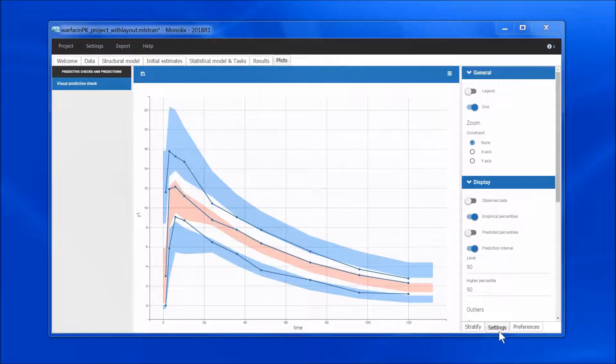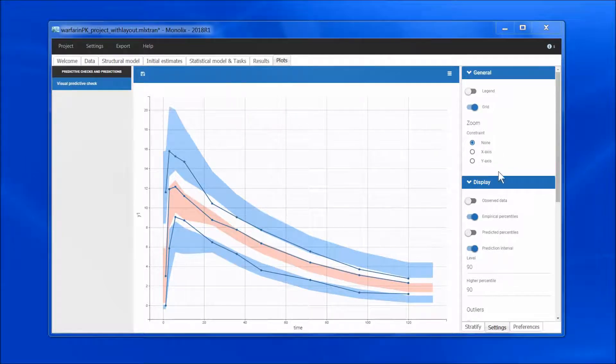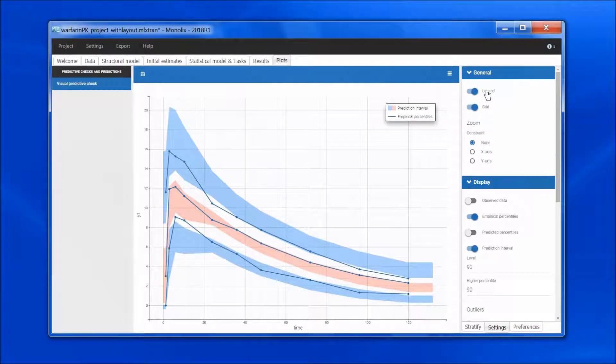In the settings tab, I can choose what I want to display, and I can for instance add the legend to the plot.